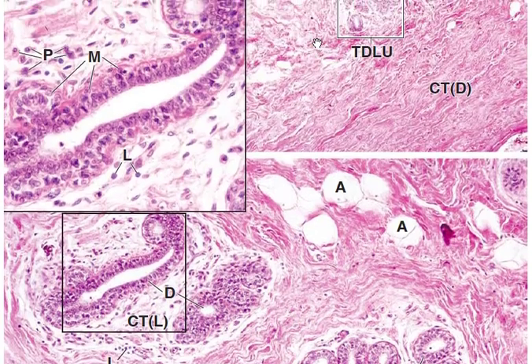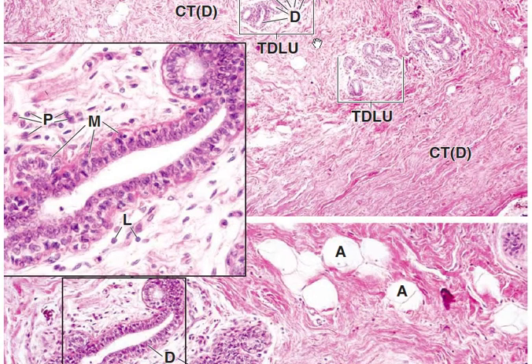The inset shows a thickening of epithelium in one location, presumably a precursor of an alveolus, and myoepithelial cells at the base of the epithelium. As elsewhere, the myoepithelial cells are on the epithelial side of the basement membrane. During pregnancy, the glands begin to proliferate. This can be thought of as a dual process in which ducts proliferate and alveoli grow from the ducts.